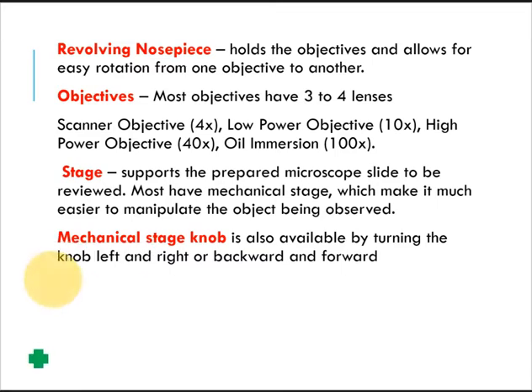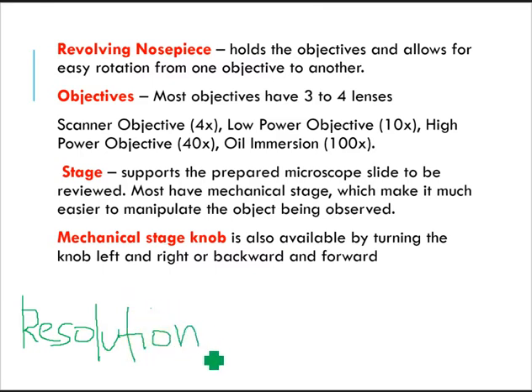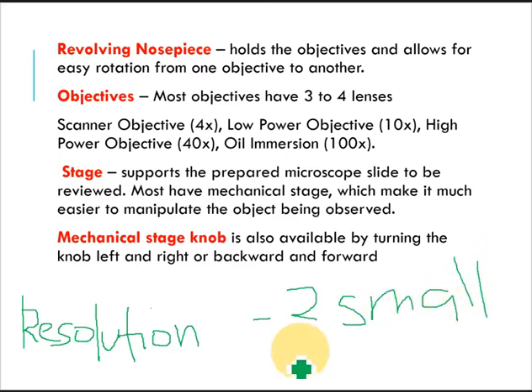Now, I want you to take note of this word, resolution. Resolution is the ability of the lens to distinguish two small objects that are at a specific distance apart.